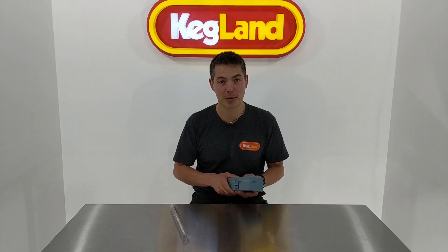Hey guys, it's Key here from Kegland. I just want to talk to you about our new refractometers that we've just got. These new ones now have an LED function which is really fantastic, and I wanted to explain it to you.